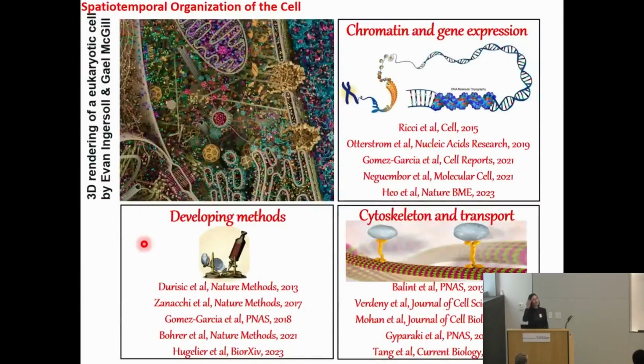Just to begin with an overview, my lab is very broad. We work on a lot of different topics. The overarching theme and goal is to understand how cells are organized in space and in time, and how that organization impacts cell function. As you know, cells are not just a bag of nucleic acids and proteins, but they're highly compartmentalized and spatially organized. In my lab, we would like to be able to visualize that spatial organization at near molecular spatial resolution and understand its impact on cell function.